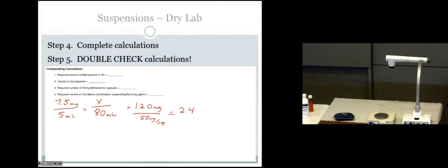Thank God, we did that all semester. Good. I'm too lazy to do that. I don't want to do that, okay? Because do I have to just make 80 mLs? I could make more, I can make any amount more, so here's what I'm thinking. I'm going to try to come up with a volume to make so that I can use an even number of capsules. Instead of having to do that whole proportion thing, let's just do more than this.